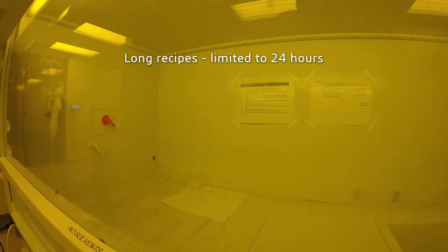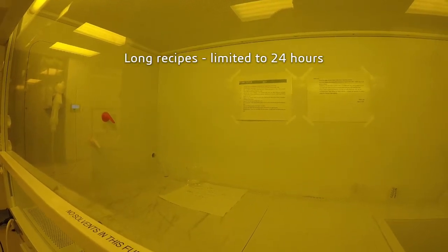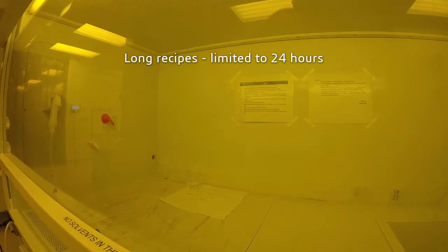For long recipes, push your experiment to the back of the hood and do not leave chemicals in the hood for longer than 24 hours.